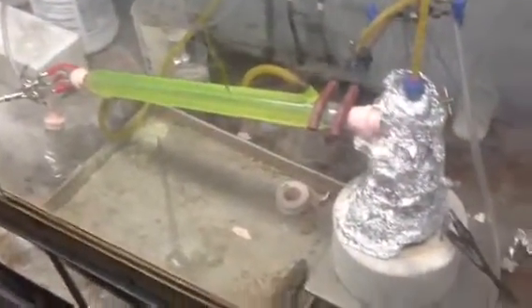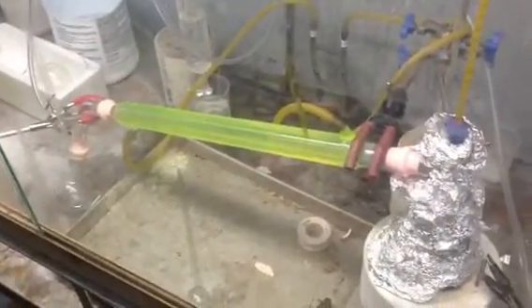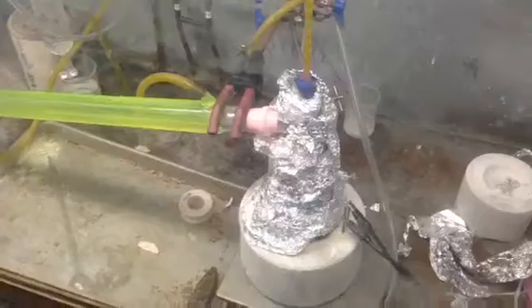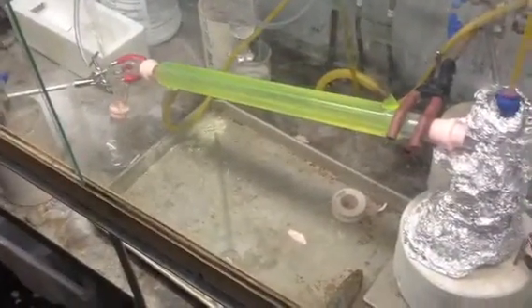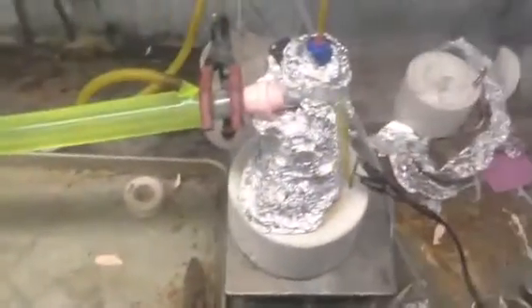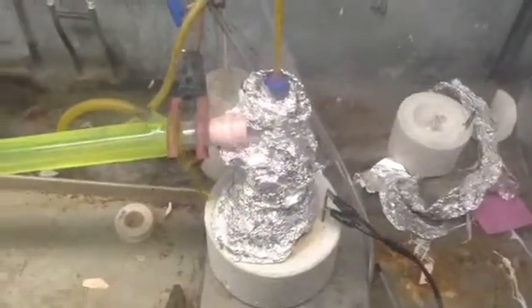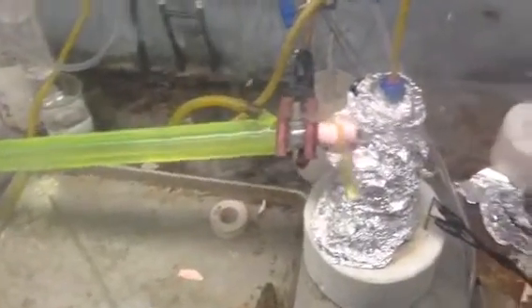I am going to say right off the bat this is stupidly dangerous to do. You should not try this at home. I have the proper equipment, proper setup, everything is sealed, everything is isolated. I have a vacuum trap. It is a completely closed system. But yeah, I just thought you would like to see it.